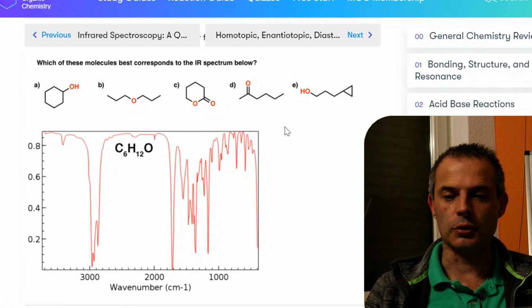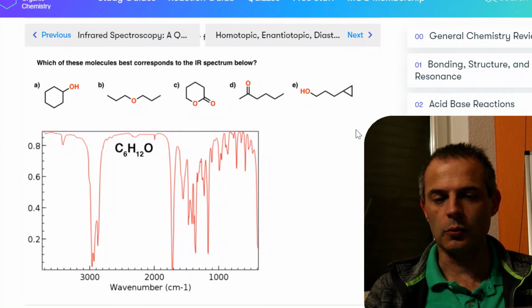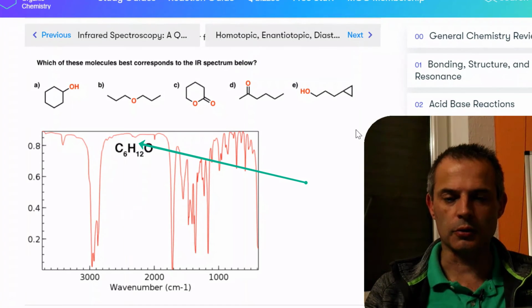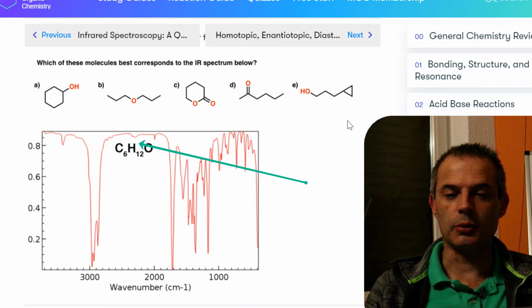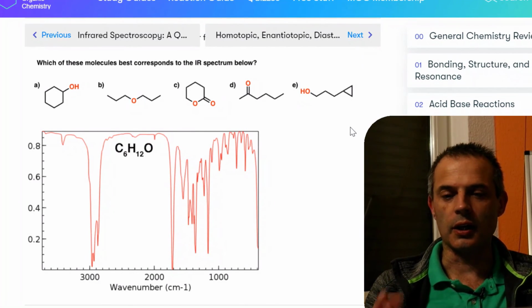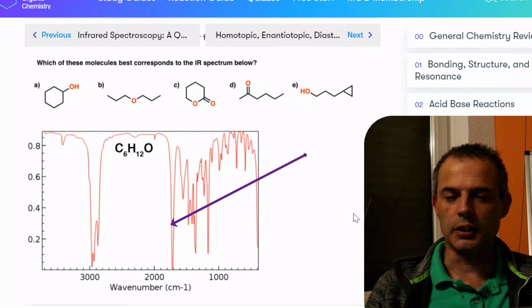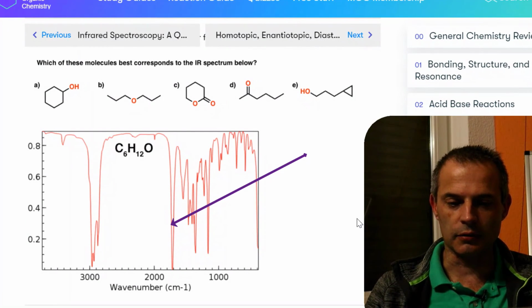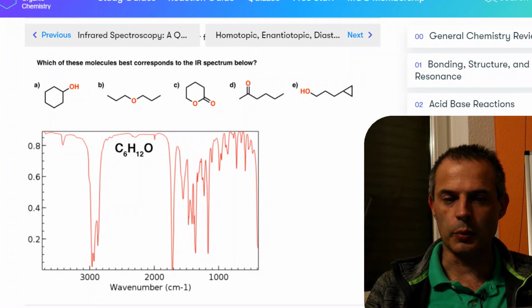It's probably a little bit of water in the sample. If we go down, we can see there's nothing for a while, and that's very common in infrared spectra. As you noticed in the table, in this region there were a lot of fairly esoteric groups that we are not going to encounter that often. Then we see this massive sharp peak, which is obviously something important, and if we count down from 20, 19, 18, it's at 1700 and something, so that is clearly a C double bond O peak.